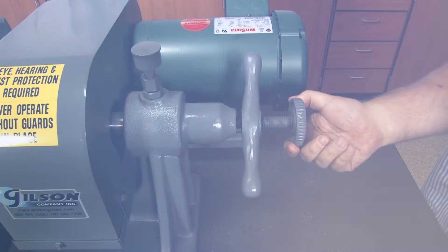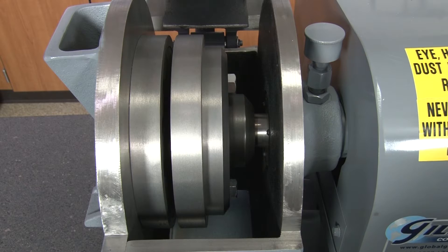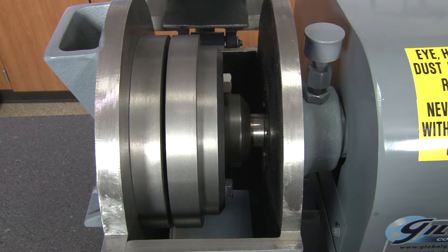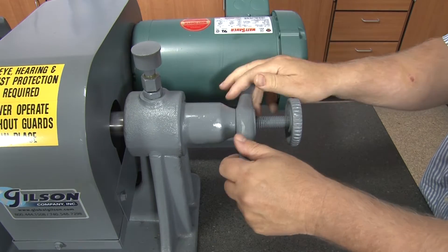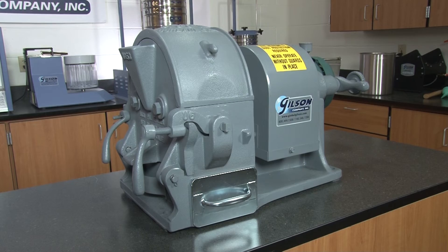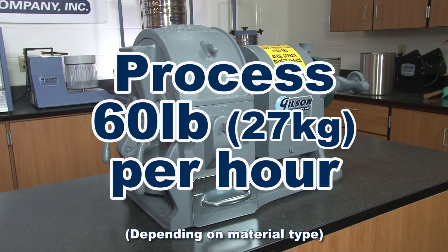A threaded knob with a locking lever adjusts the gap between the two 8-inch diameter grinding plates to control the particle size output. The LC53's throughput is about 60 pounds per hour, depending on material type.